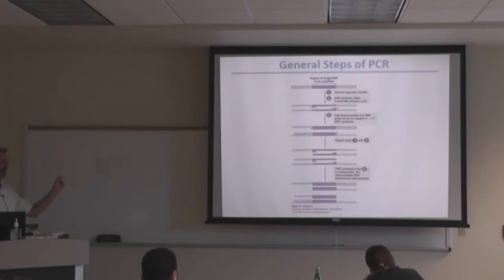So you use known sequences, look in genomic libraries to see what bases change, and put together a mixture of oligonucleotides. The primers aren't all the same. They're non-specific, sort of. You amplify that region and normally get a nice streak of DNA because it's not all the same. Then you digest any of the leftover oligonucleotides with the exonuclease. Then you have specific primers for the region you're interested in, and you amplify that within the nested portion of the original one.